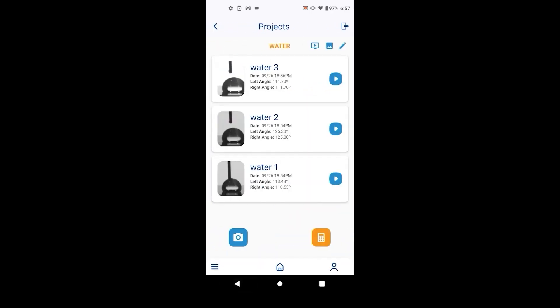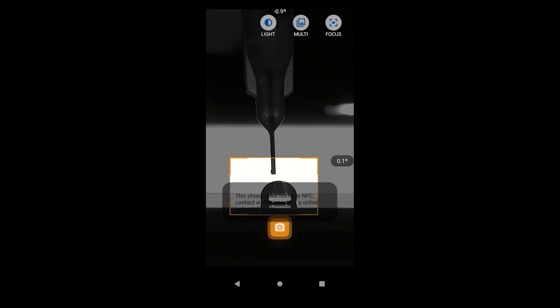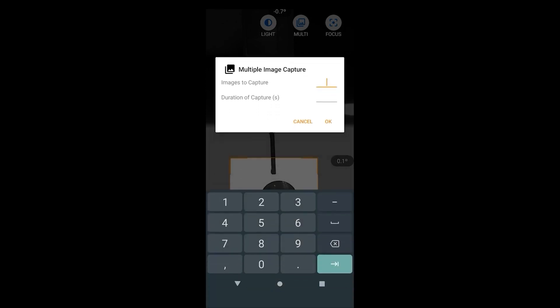Now we will demonstrate how to use multi-capture for dynamic contact angle measurement. The app's multi-capture function can be used to take multiple images in a set time frame. The maximum frames per second without an SD card in the phone is 10 fps.